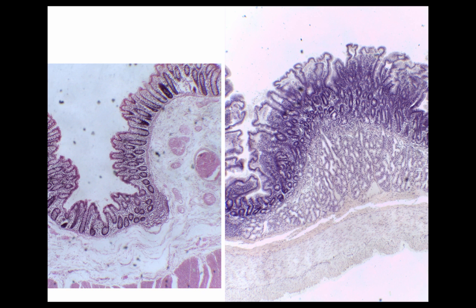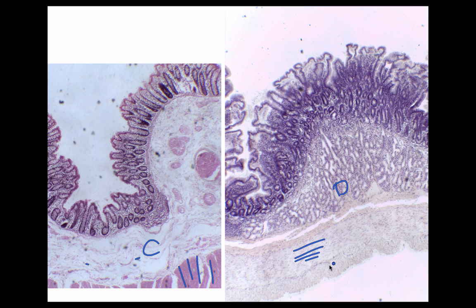Just to compare: on the left we have the colon and on the right the duodenum or small intestine. The difference is that you get that color change in the duodenum, and you can still see the glandular appearance of the submucosal glands, whereas in the colon the submucosa looks like loose connective tissue with more random organization. You also have the striped-looking circular muscle in the colon. In the duodenum you get the inner circular layer — cut longitudinally in this case — and the outer longitudinal muscle, cut transversely here.